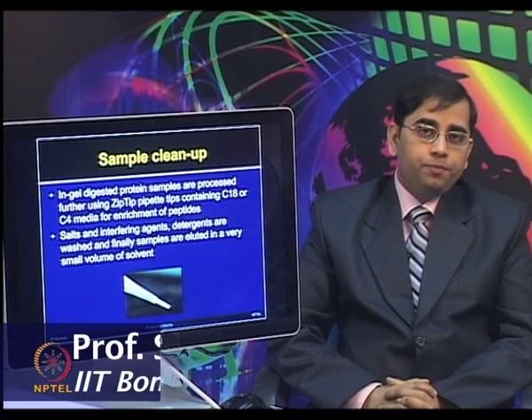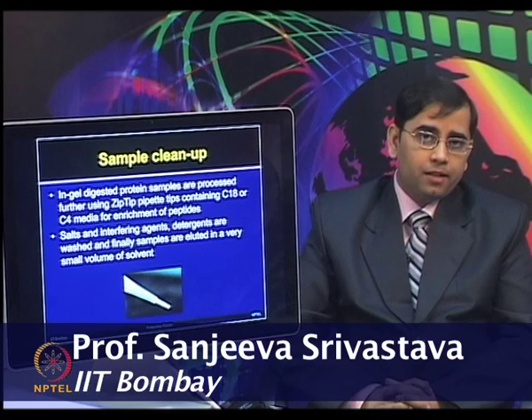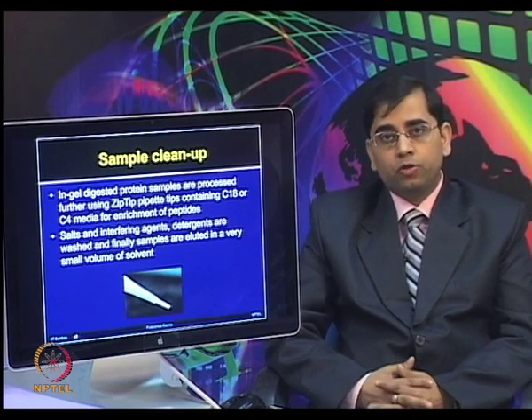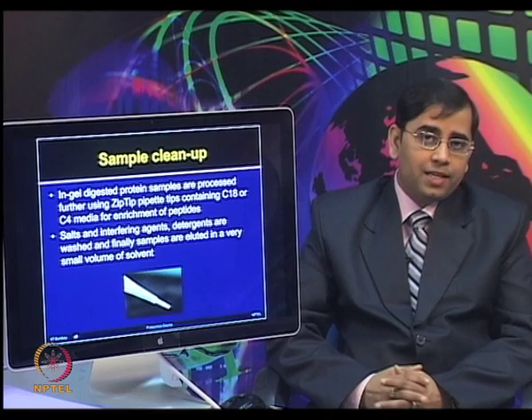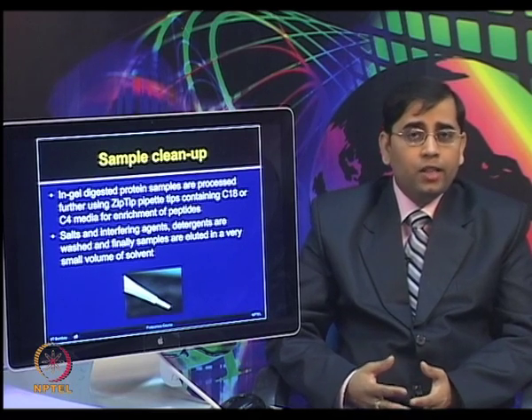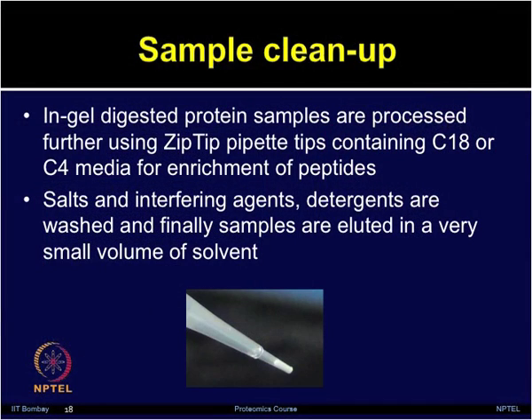After watching this video, you are now clear about the in-gel digestion process and how various steps are important to perform these experiments. Once you have done the in-gel digestion, you can directly use these tryptic digests for further mass spectrometry analysis, but it is often recommended that you add one more step in between, which is sample cleanup. You do not want your columns or your MALDI instrument to get clogged due to salt or other interfering residues present in the mixture. So, it is recommended that one use a cleanup step in between.